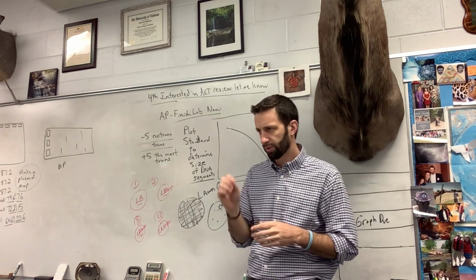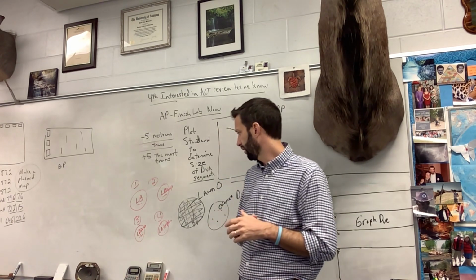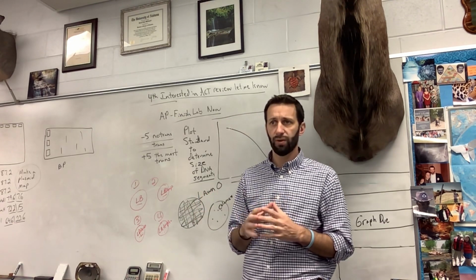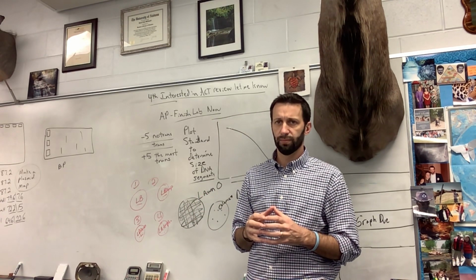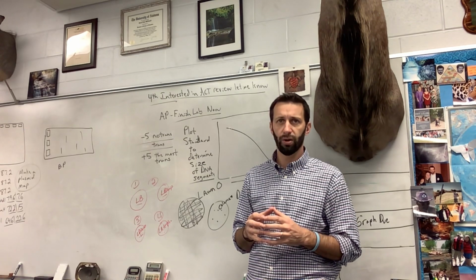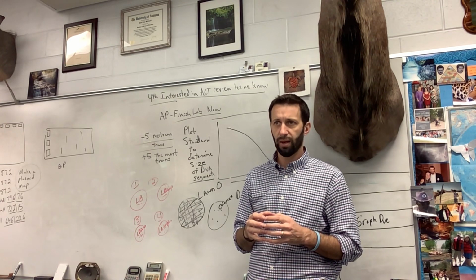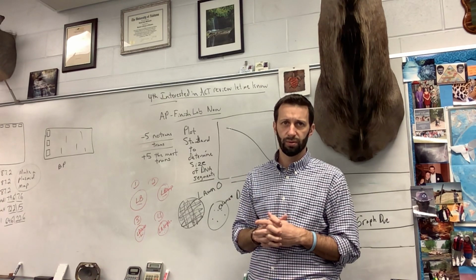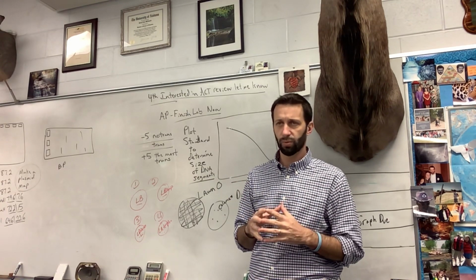Okay, and they'll just appear as little dots. If you see a lawn on there, I'd like to see that because something strange may have happened. Now, it could very well be that you have nothing on there, which means what? It didn't transform at all. So, out of 5 groups this morning, 1 group didn't have any transformation. The other 4 groups did. So we're going to see how you guys did.